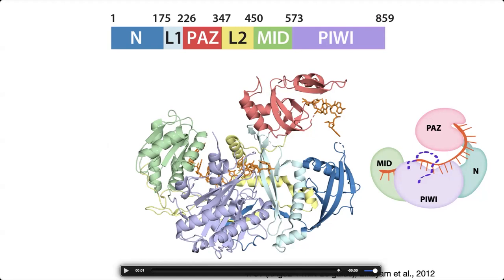What about the eukaryotic insertion? Well, that's actually in this part of the protein here. You can see on either side of the eukaryotic insertion these ends here, but the eukaryotic insertion itself is actually in this region that we can't visualize with the crystallography, making HDX-MS a really great option to see what's going on. But why can't we see what's going on in crystallography?